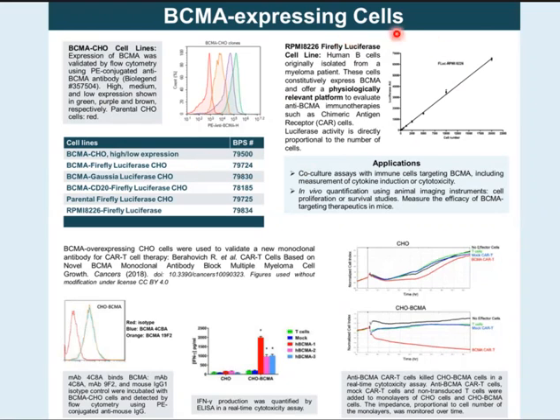On the right, I am showing an example of the human B cells RPMI 8226, which constitutively express BCMA and represent a physiologically relevant model. They were stably transfected with luciferase. Now, since the luciferase activity is directly proportional to the number of cells, as shown in this graph, the cells are ideal for co-culture experiments, for example, when testing the cytotoxicity effect of anti-BCMA immune cells.